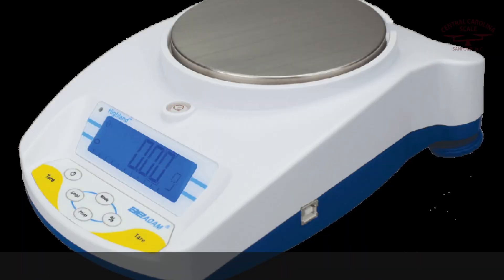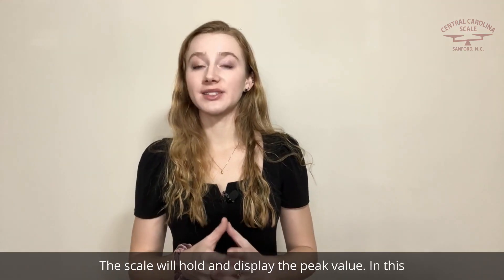For example, if your scale measures 3kg, 7kg, and 5kg on it, the scale will hold and display the peak value — in this case, 7kg.